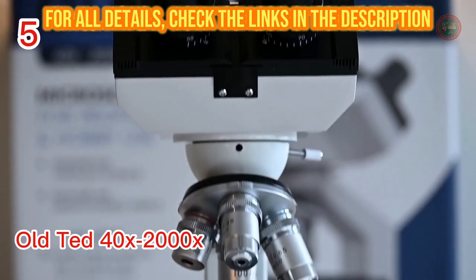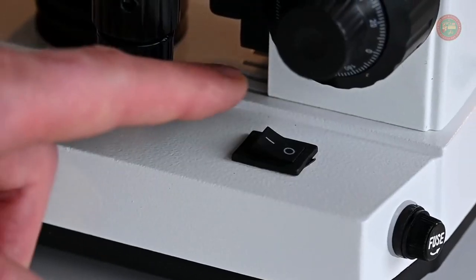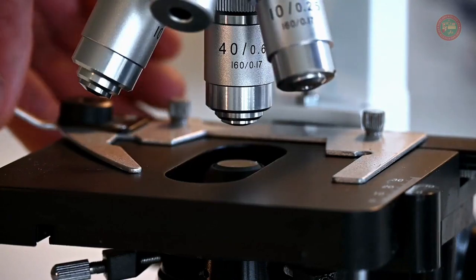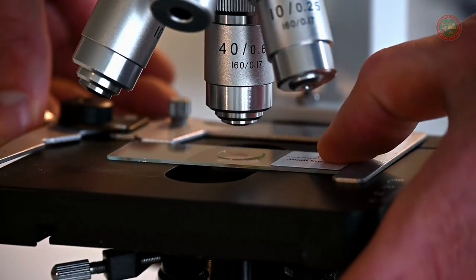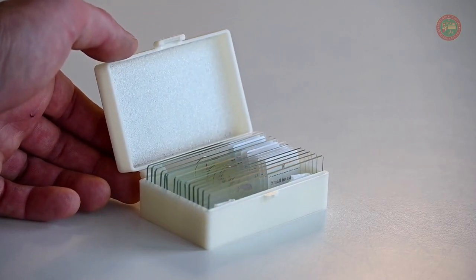Let's see how to get started using your brand new microscope. Connect the power supply and turn on the microscope with the button on the side. Next, you want to add a sample to the slide holder. This could be one of your own samples or one of the included biological specimens.